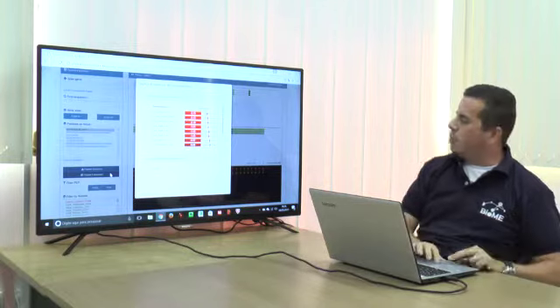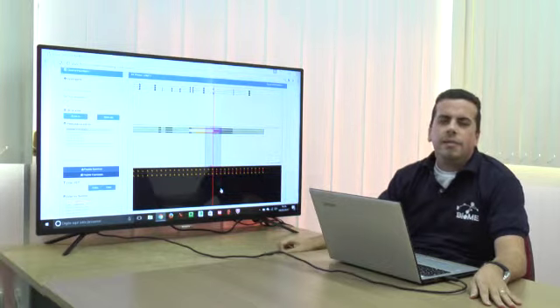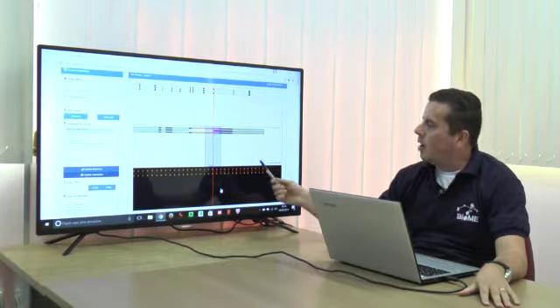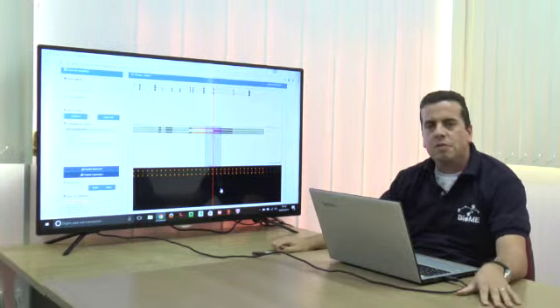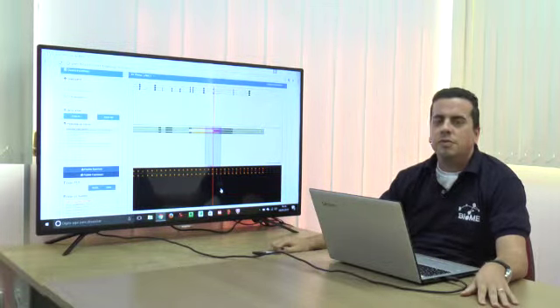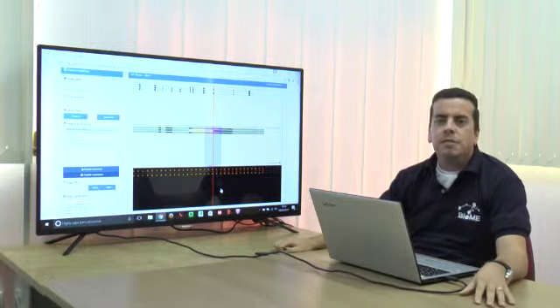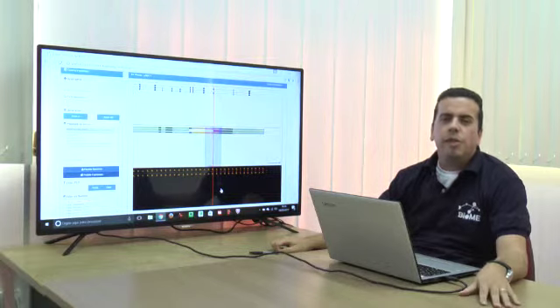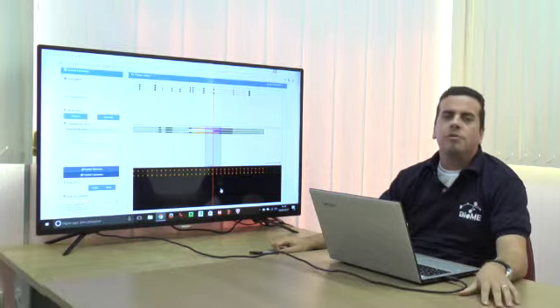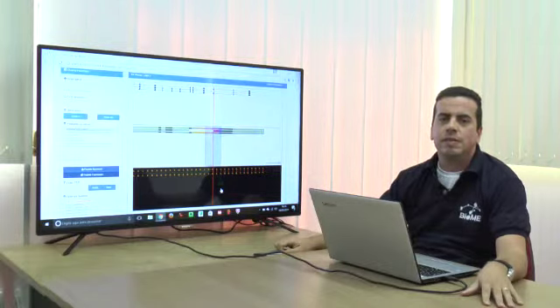The most important thing for us in developing this tool was that it not only gives you a genomic browser interface for peptide identification, but also that all the indexation of the peptide sequences within the genome is provided by the tool as an output. So you can collect this indexation and do your own post-analysis. For example, in this case, which is only illustrative, we used it to detect uncommon novel isoforms which have loss of transmembrane domains. We used this indexation to quickly get access to this kind of information.